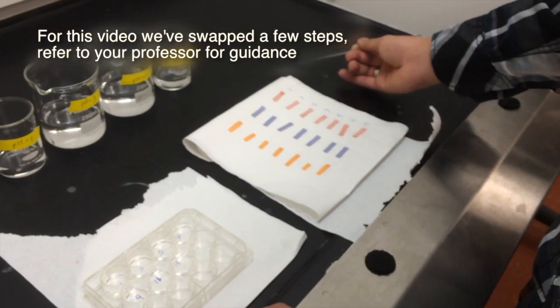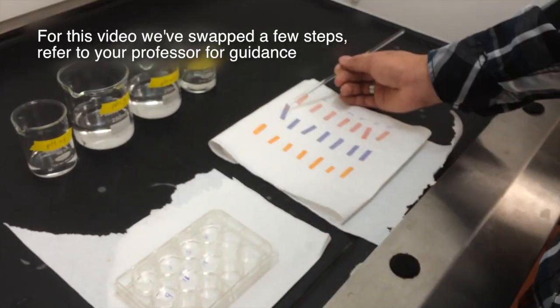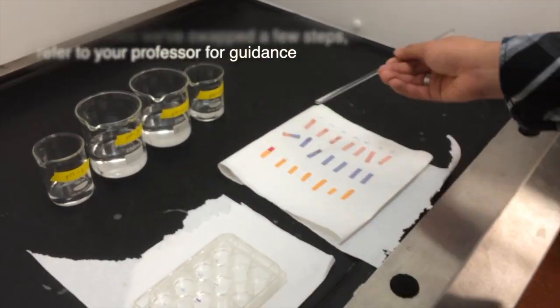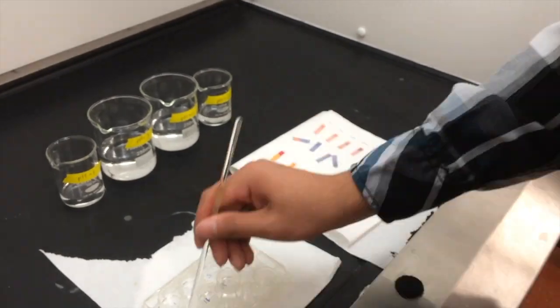Using a glass stir rod, transfer one drop of each solution to a piece of red litmus paper, blue litmus paper, and pH paper. Remember to rinse the rod with deionized water between the solutions.